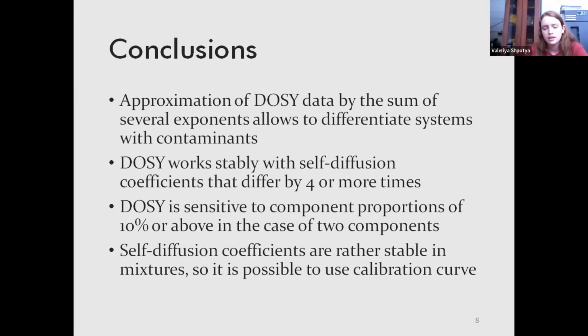it's possible to use the calibration curve for further studies. In our plans is to work with different models of approximation and use statistics for more accurate error estimation. And after we get the optimal parameters for approximation and for experiment conditions, we will use this method for block copolymers and homopolymers, because these systems have some inclusions which are hard to remove, but still they should be counted when we calculate characteristics of block copolymers for each guest we want to include in this system.